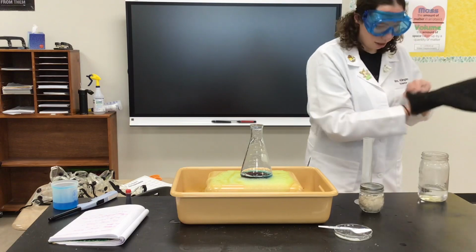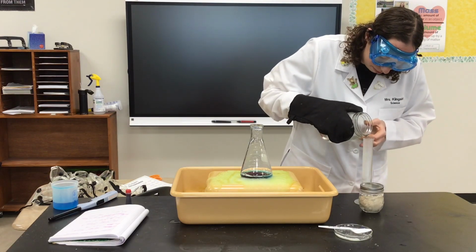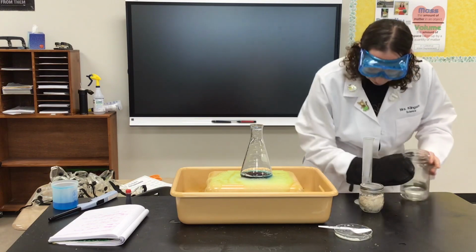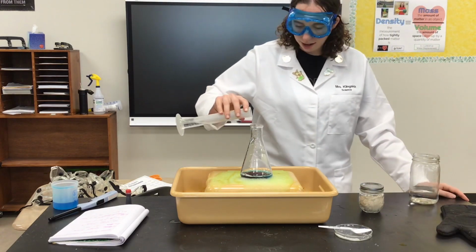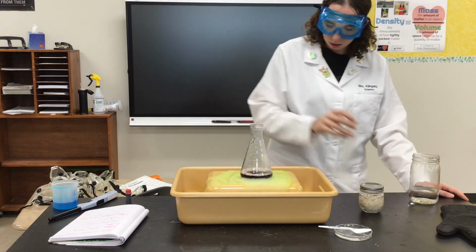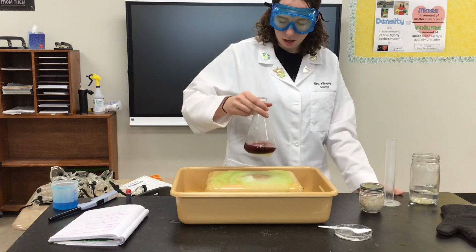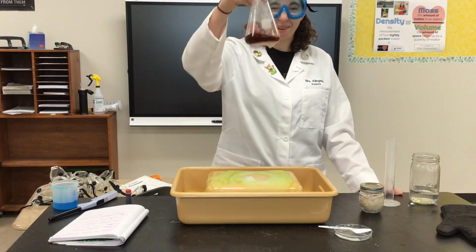It's so tricky to get this, huh? All right. Perfect. I'll go with that. All right, so I'm gonna add that in. Okay. Again, I'm gonna swirl it around. Again, I have bubbles. That's from the soap. It looks kind of like blood, huh?